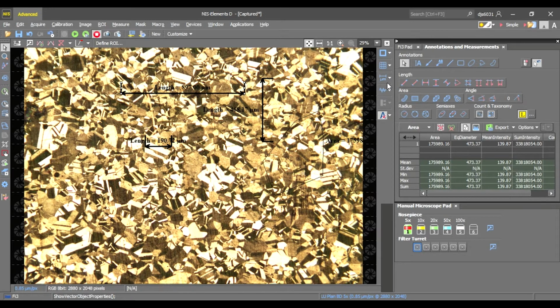But anyhow, the other thing I want to show you real quick specifically is the scale bar. If you just click the scale bar, it will put a scale bar on the bottom. Again, if you right click and go to scale properties, you can change a whole bunch of the different scale properties. You can change the style, the font, the color, etcetera.